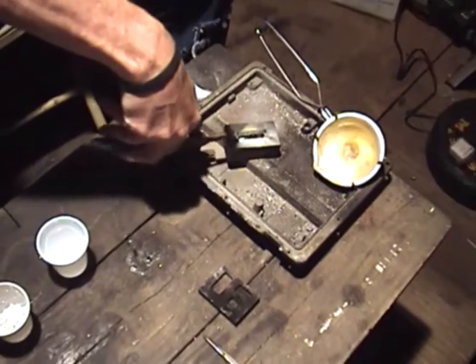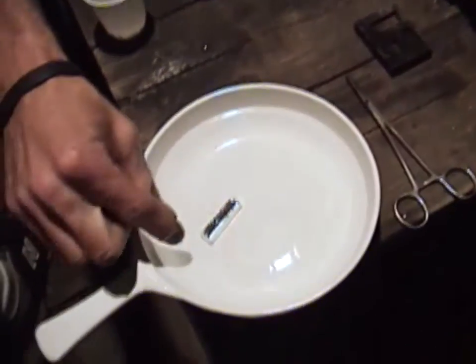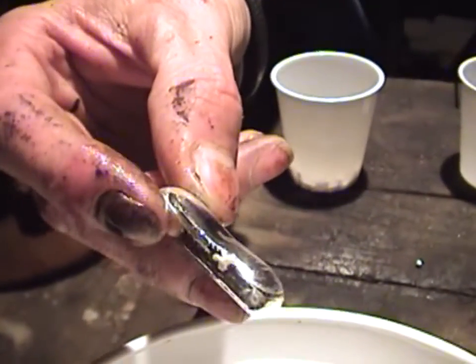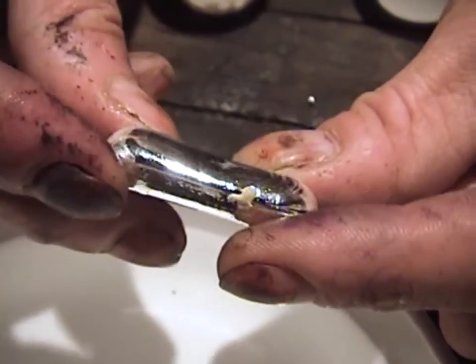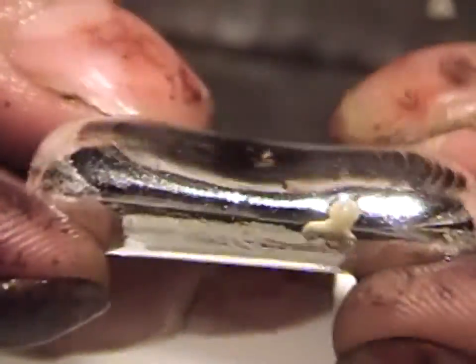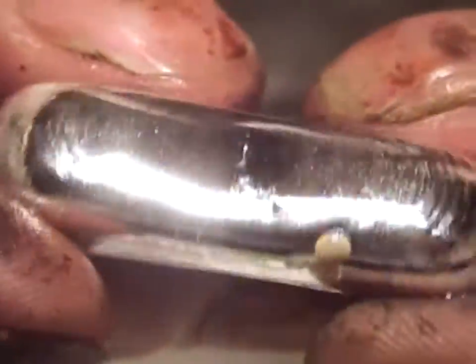We're going to take a pair of channel locks, reach over and grab our mold, and flip that bar up and let it come out into the dish. Voila! Now I don't know if you could tell, but right here on the side is some flux, and there's a little flux over here too. You don't want to rub these bars because you will scratch the surface — they're so fine and shiny. We're going to take this inside and put it in some dilute sulfuric acid to remove that. I'll explain that in the next step. We'll go ahead and melt a couple more bars while we're here.